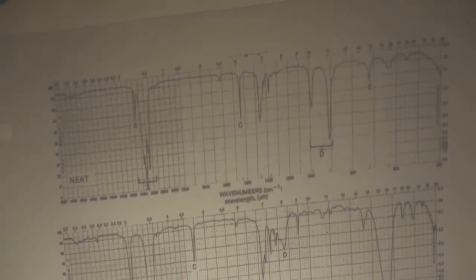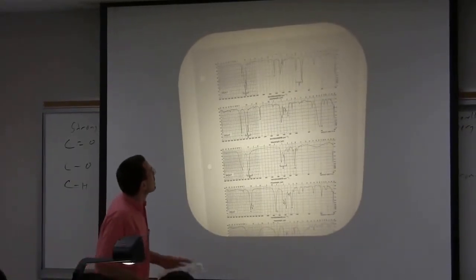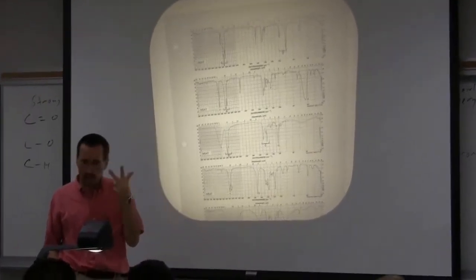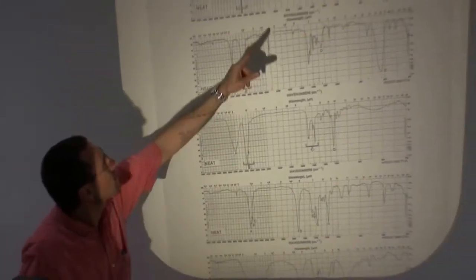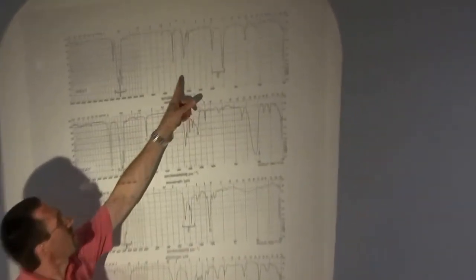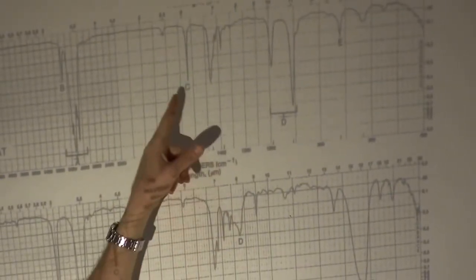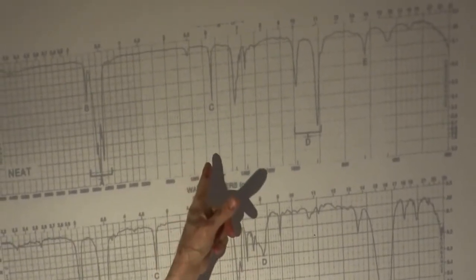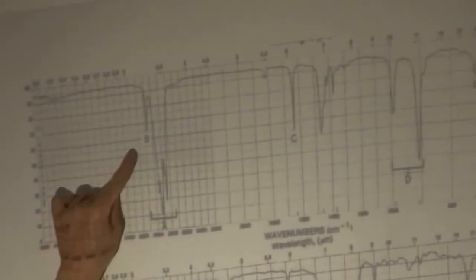Alkene. Okay, great. Actually, I'm hearing exactly the sort of stuff that I like to be hearing here. So I've heard carbonyl, aromatic, and alkene, and we can actually take a very good guess. This peak here obviously stands out. Remember, I said draw a line in your mind at 1600. So it doesn't look like a carbonyl. A typical carbonyl is going to be a little stronger and a little bit fatter. It looks like an alkene. This should clue us in.